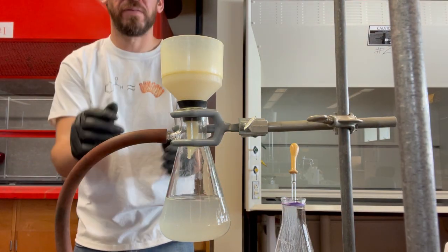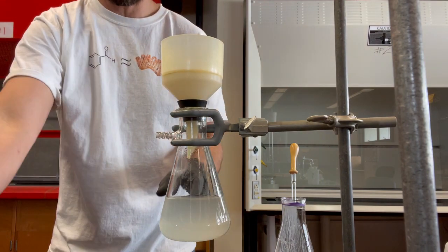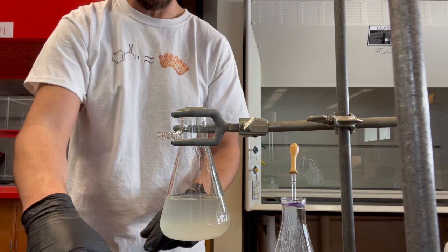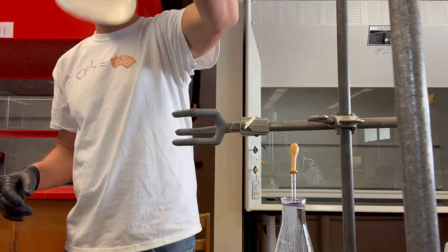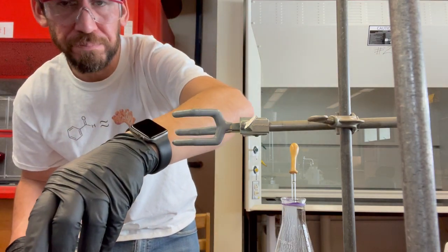Okay, so it's off, and I'll go ahead and carefully take this off of here. Take this guy, just set him aside for now. And then what I want to do is measure the volume of this solution. It looks a little cloudy, like some sediment might have gotten through, but that's okay.